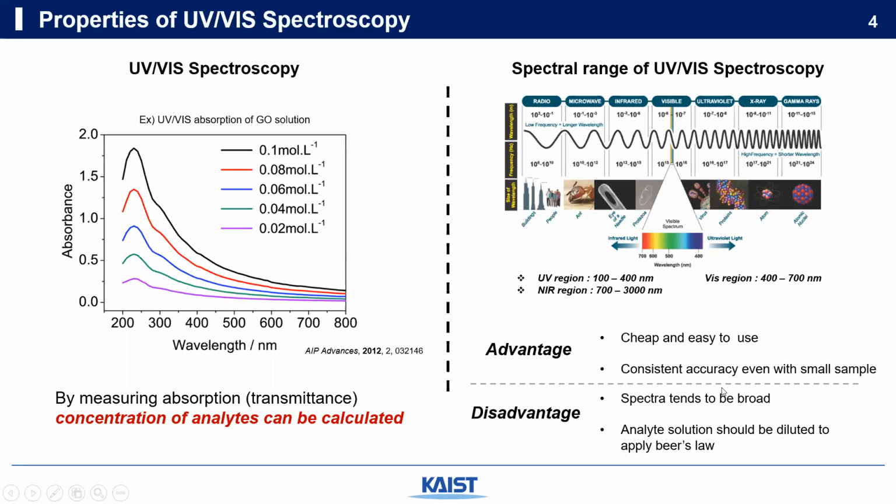However, it also has disadvantages, including that it results in broad spectra, and the analyzed solution should be diluted to apply Beer's law.